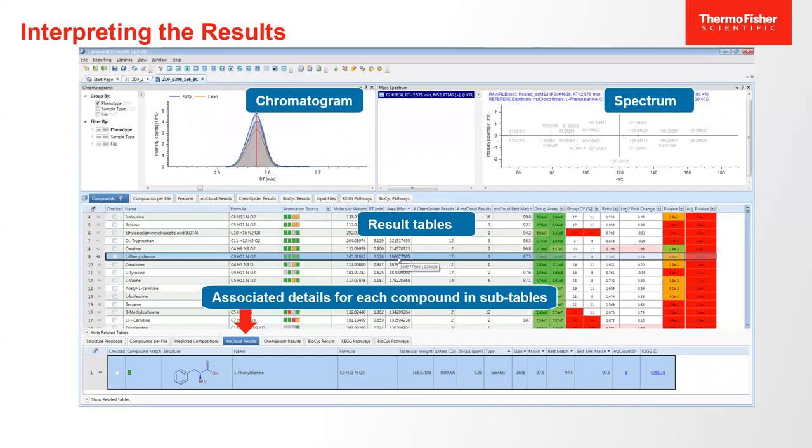You're going to identify the workflow, which defines the type of data you want and the type of results. You're then going to put the samples into as many groups as you can. And then you're going to hit run and let the thing run.